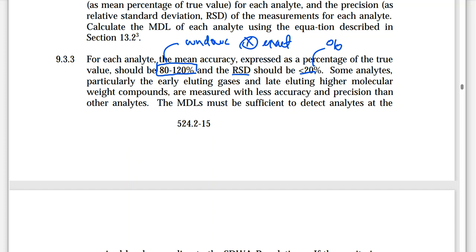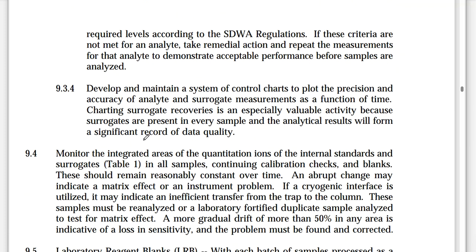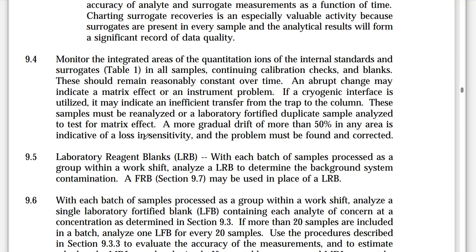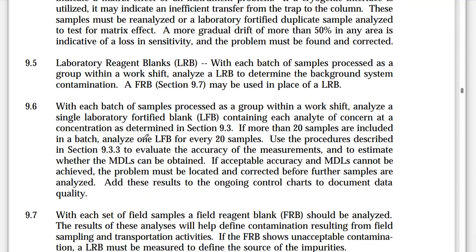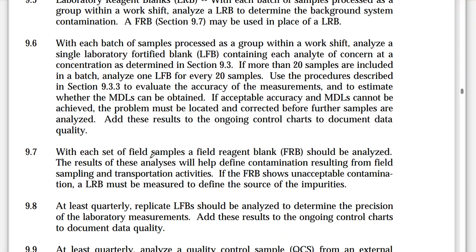that quality has to follow to make sure we got legit data that comes from the instrumentation and the lab method. As I continue on, you're going to see multiple areas here for quality control. It is often a beefy section, and that's because all of these definitions were all quality control samples in a way, and we want to make sure that we give credit to as many of those quality control samples as we can.